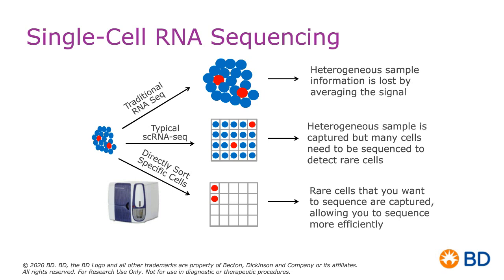Now, from here, you would get your mRNA information, and you could ask a lot of interesting questions from your experimental to your control. And if you have the capabilities of something called index sorting, you could correlate what was found in your mRNA with the proteins that were expressed on your cells based off of your flow cytometry panel.